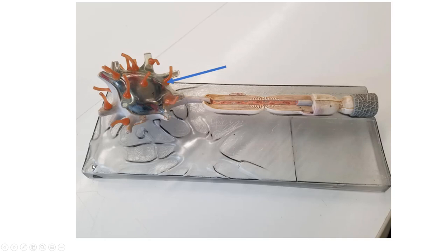This confuses a lot of students. Many students assume that these orange-looking things are dendrites—they're not. These are the dendrites here. What you're looking at are basically axon terminals from other axons coming in and synapsing here.